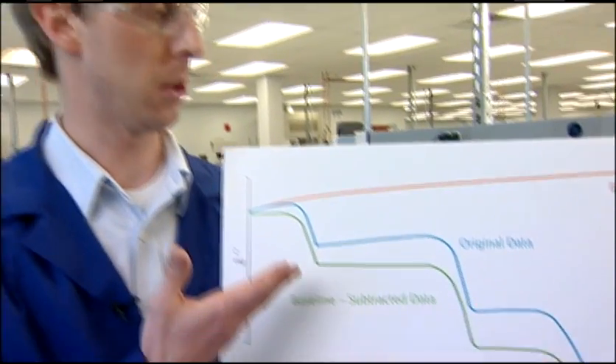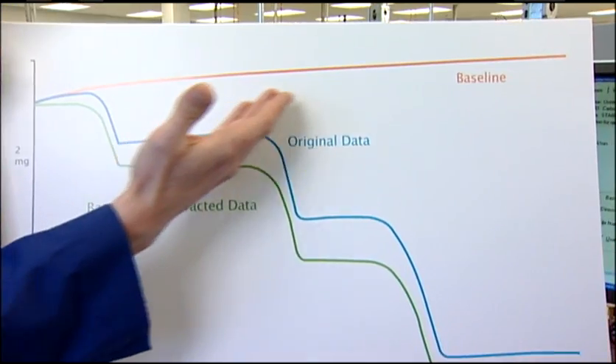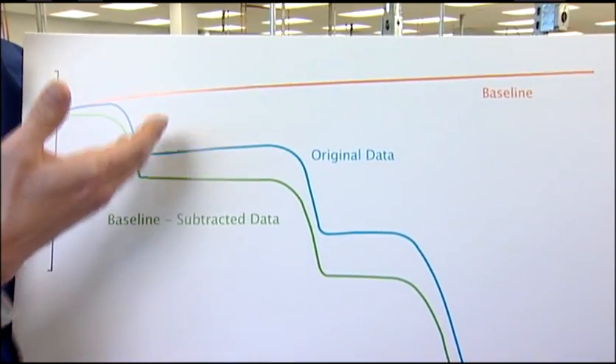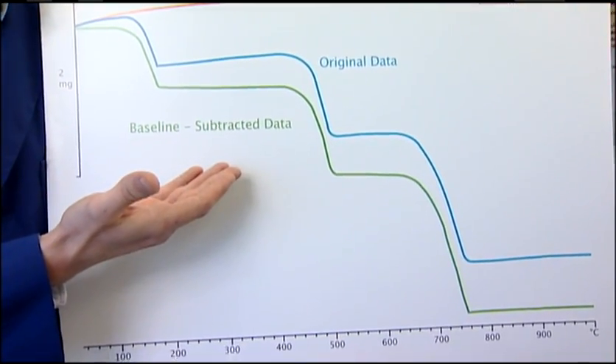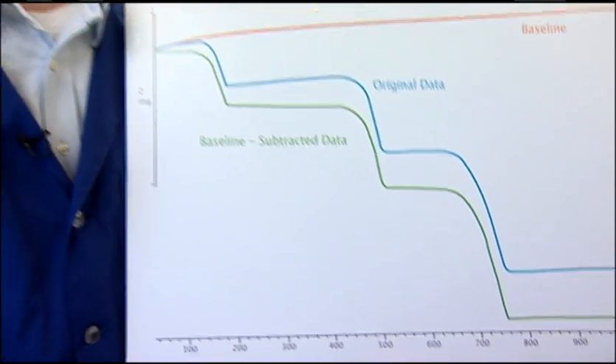In this example, you can clearly see the impact of a poorly designed TGA. This competitive instrument suffers from a huge buoyancy effect, as shown in this baseline. That buoyancy is translated into our sample data, and it really isn't until we subtract the baseline that we can achieve accurate results. In fact, the self-proclaimed balanced technology leader recommends a baseline run for virtually every experiment.